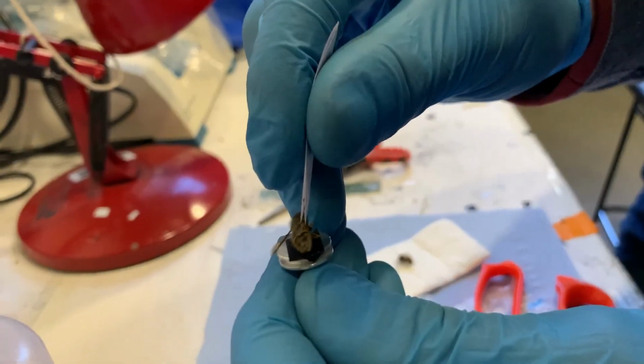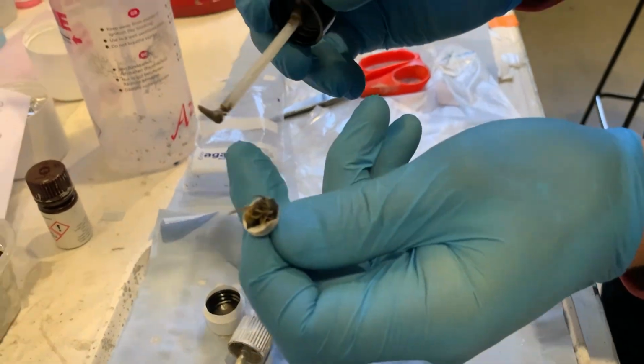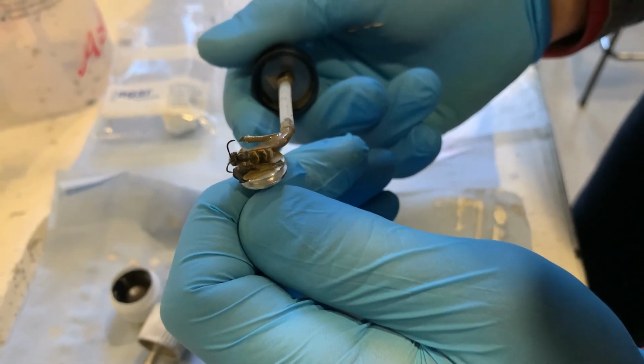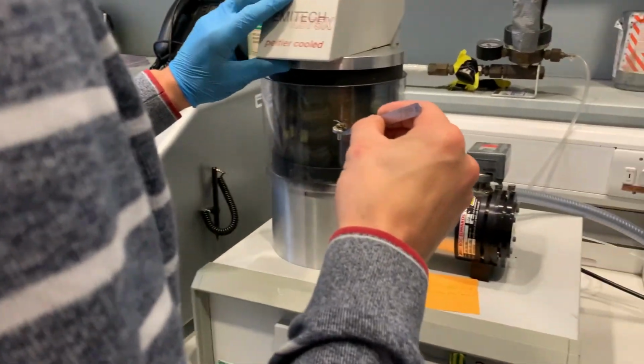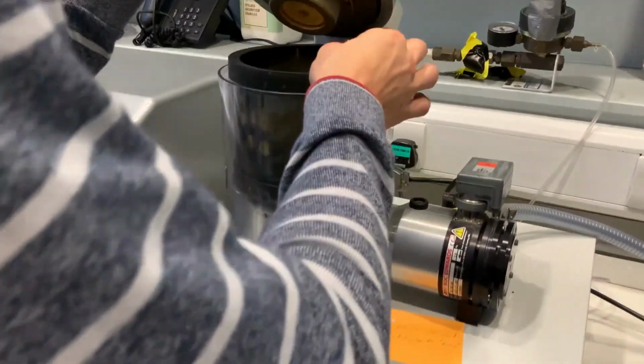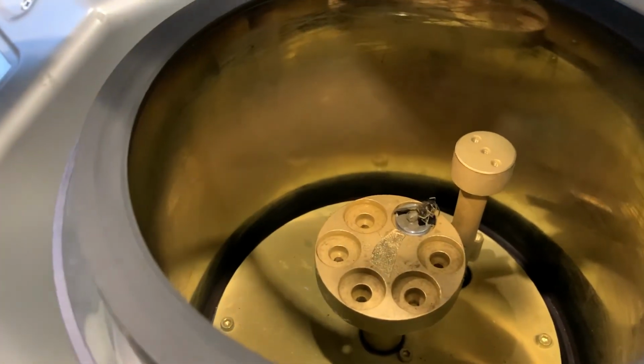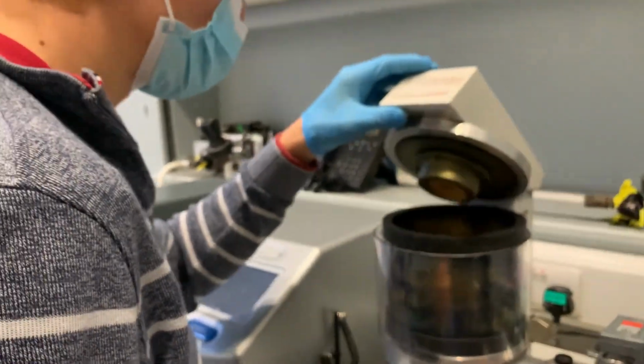Let's see how this works in practice when imaging a fly. We first mount the fly onto the holder using conductive paint. Next, a thin layer of gold is deposited onto the fly. This is to make the surface conductive, as otherwise it will become charged by the electron beam, causing the image to be distorted.